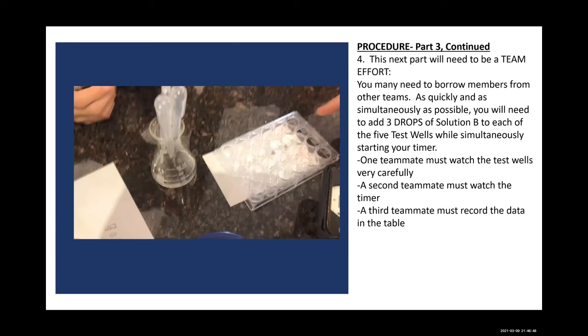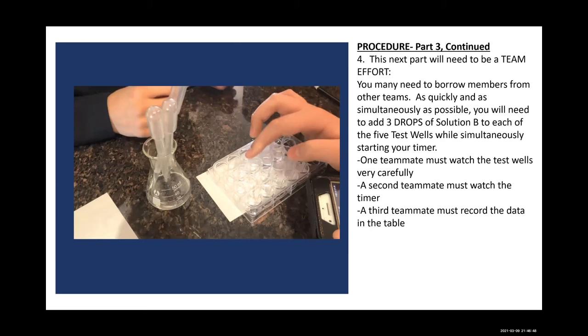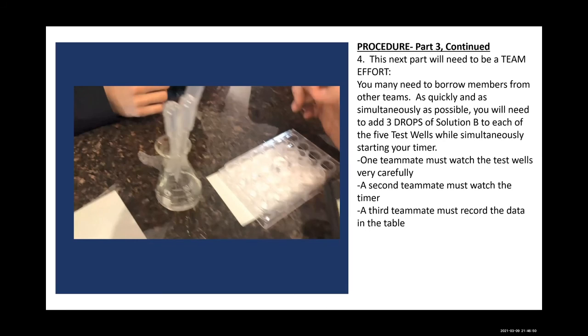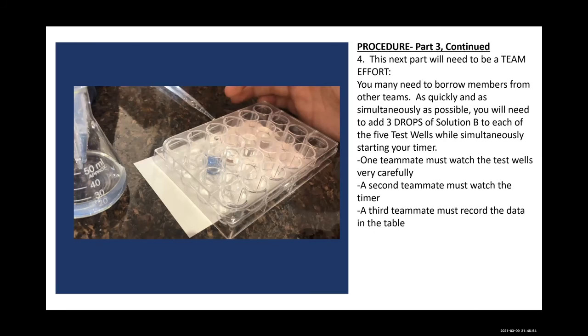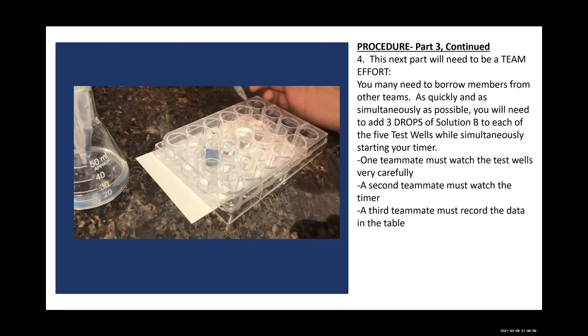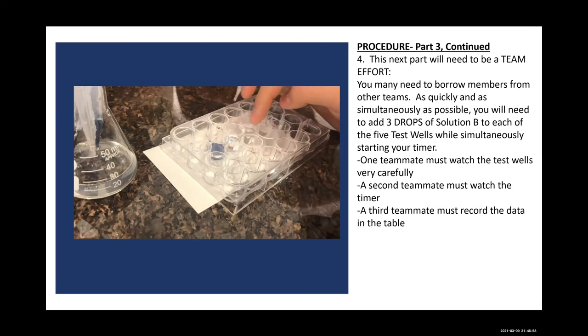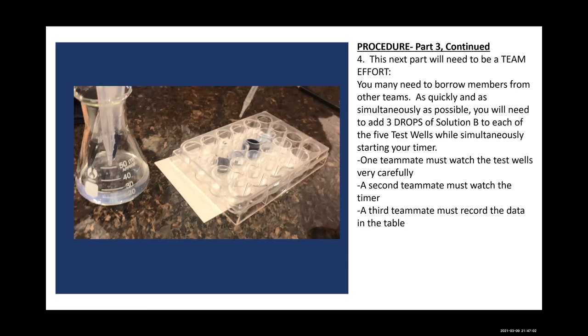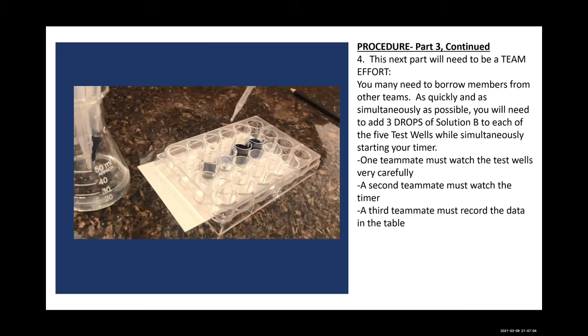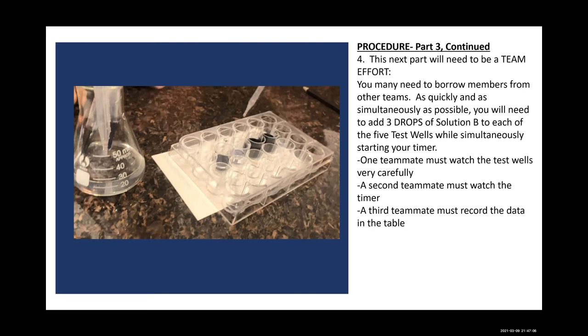No, that's too faint. That one's turning, 17, or 18, sorry. Okay, 18. 22. 18 and 22. 27. 30. That one was first. That one turned, okay, 40. Oh my God. Sorry, 35. Look at that. Okay, so 40 and 35. I don't know what I'm doing.